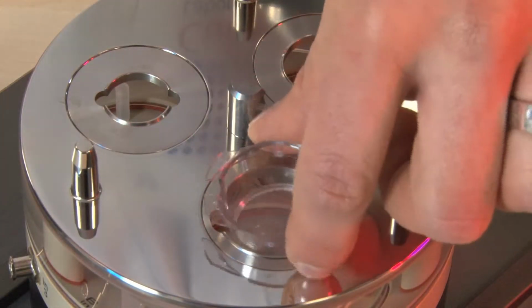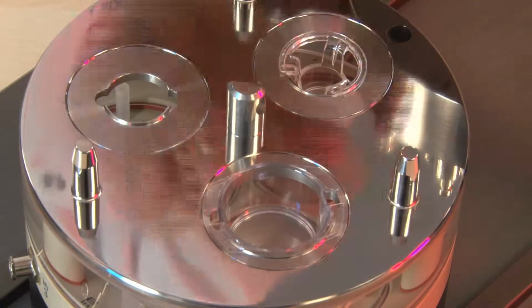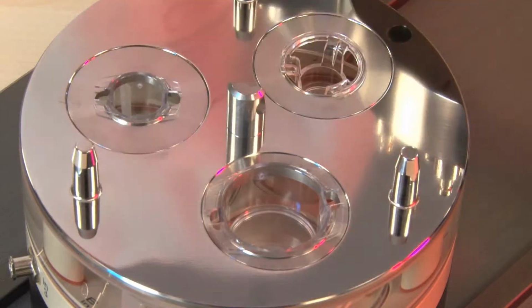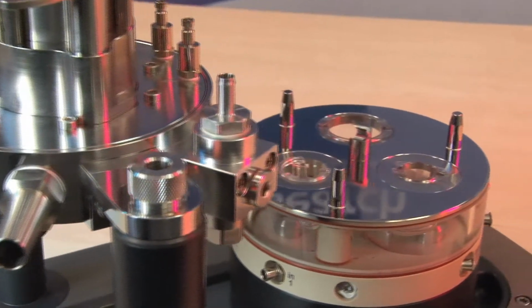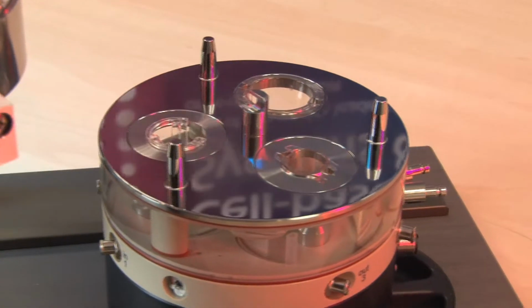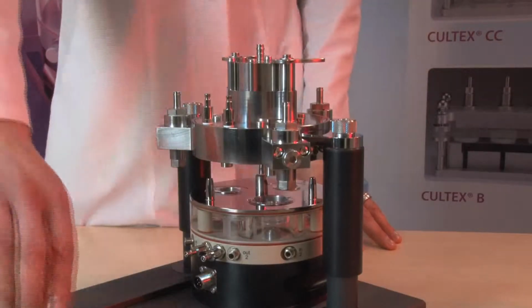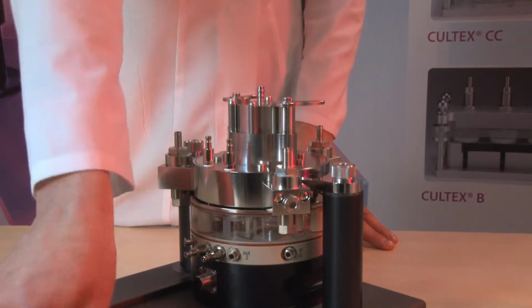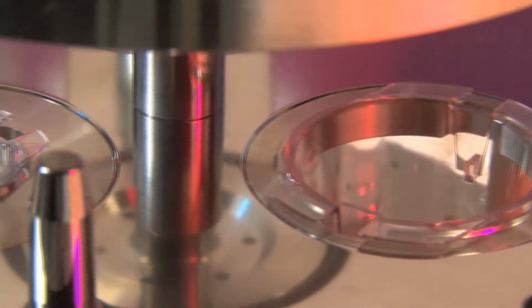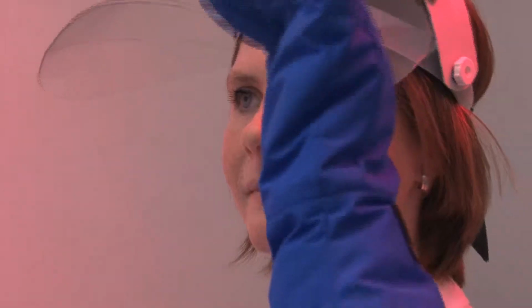For this, the CULTEX RFS features 3 sample positions for all current transwell inserts or Petri dishes in various sizes. You can examine monolayer cultures, tissue samples, and even 3-dimensional tissue constructs. Whether gases or volatile compounds, particles or realistic atmospheres, the precision of the module allows optimal direct exposure of the cells to the test material. Thus, consistent and realistic results are achieved in all tests.